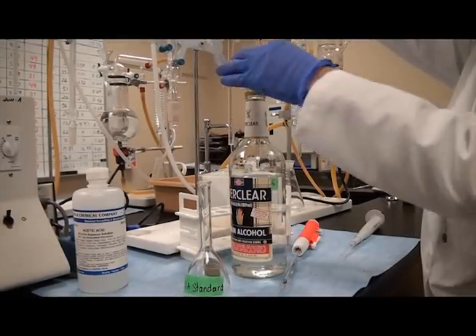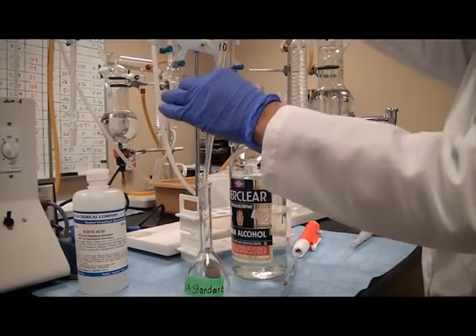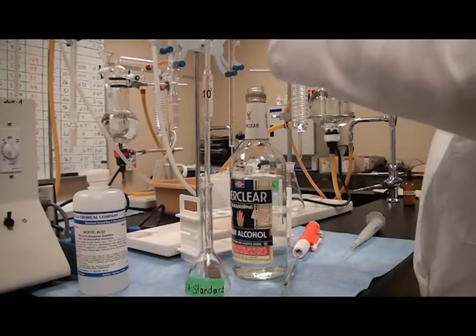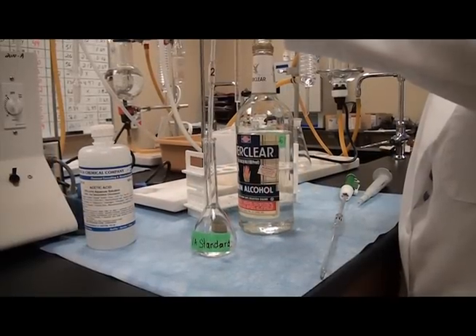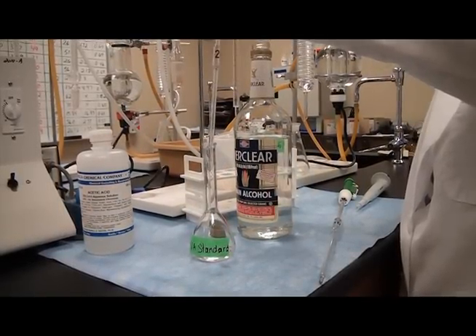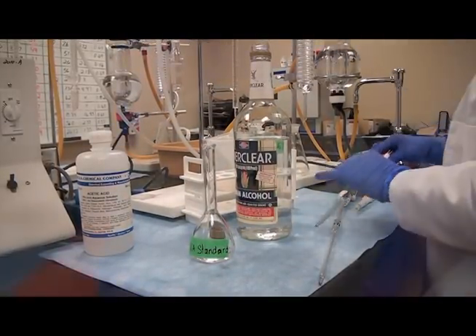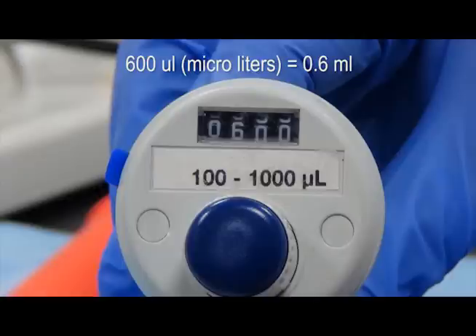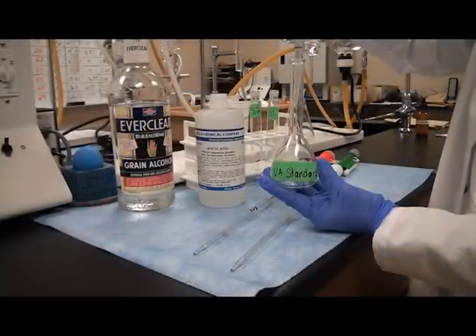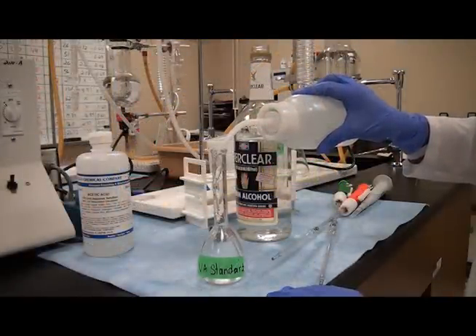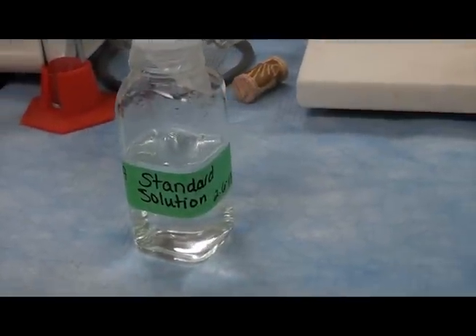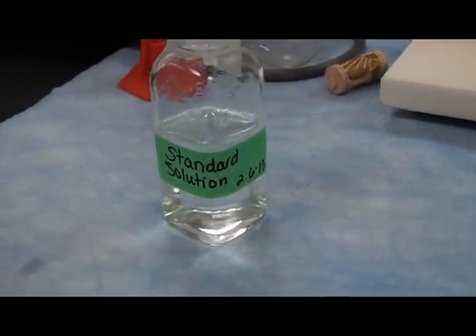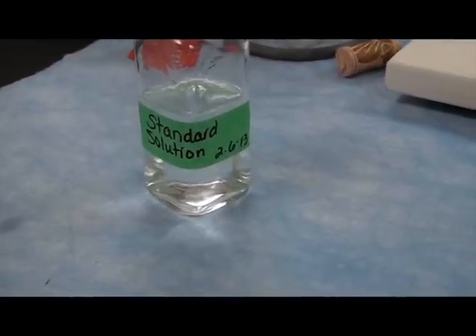First, we'll need to create a 0.06% acetic acid solution to standardize our measurement. Use a 100 ml volumetric flask and add 12 ml of grain alcohol, along with 0.6 ml of 10% acetic acid. Bring the flask to volume with DI water. Place the acetic acid solution into a labeled and dated reagent container. The solution may be stored in the refrigerator for up to one week.